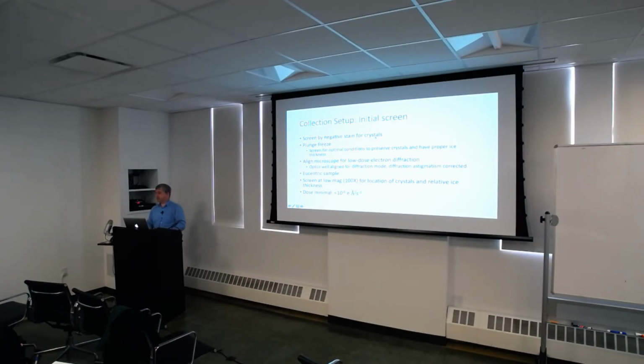For X-ray crystallography, that's not a problem. I think you screen pretty quickly by seeing if you have crystals or not. Are they birefringent? Do they look like real crystals? And I think beamline time is not so expensive anymore, so a lot of people just do their screening at the beamline. You get what you think are crystals, and even if you don't have a home source, you take them to the beamline, you put them in, and if they diffract well, you collect the data set. If they don't diffract well, you just go on to the next one. It's still a very fast experiment.